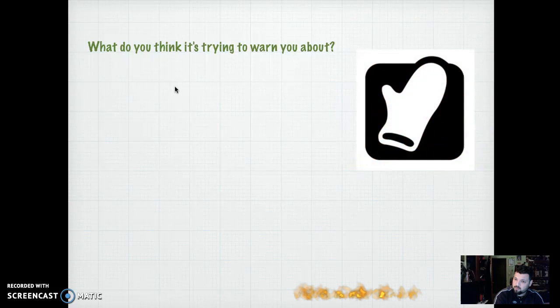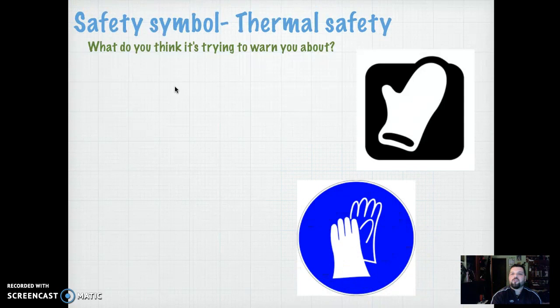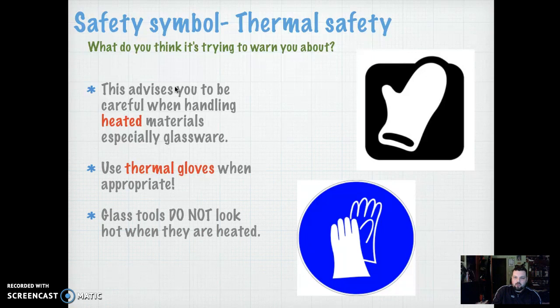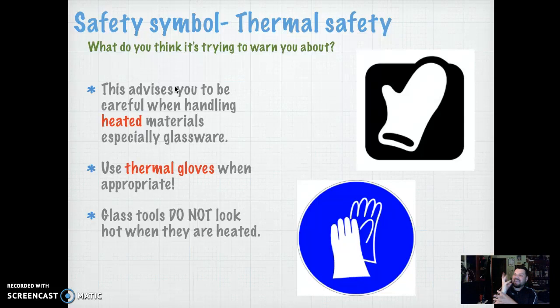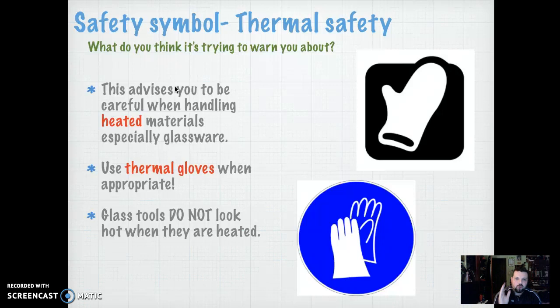Here we have another one — this isn't the cooking mitt or the washing gloves. This is thermal safety, thermal meaning heat or fire. Whenever we heat up glassware, it doesn't look hot because it's glass. Kids can make the mistake — like at home when you touch the pan or glassware and it's hot — and not realize they've just burnt themselves up to second or third degree burns. You must be wary when heating or boiling glassware. Our thermal safety gloves are available to help us touch and remove glassware from heated lessons.